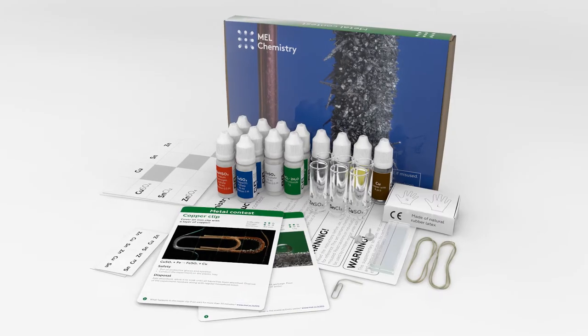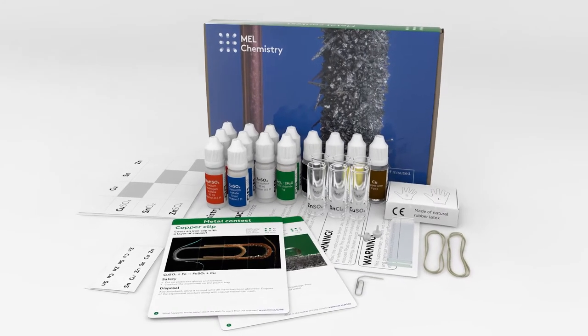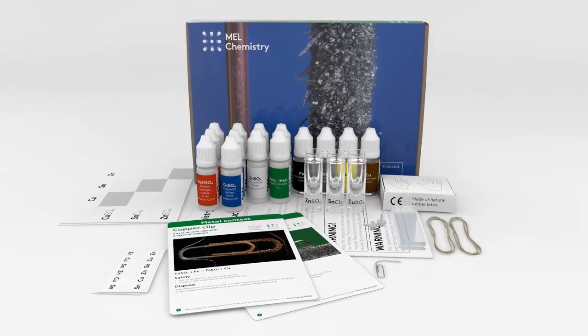Welcome to the wonderful world of chemistry. Today, with the help of the Metal Contest set by Mel Chemistry, we will learn which of the three metals, zinc, copper or tin, is the most reactive.